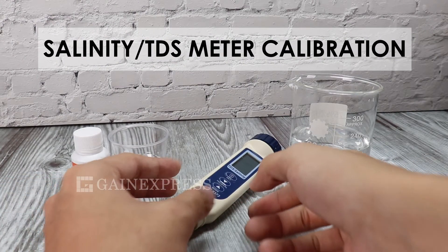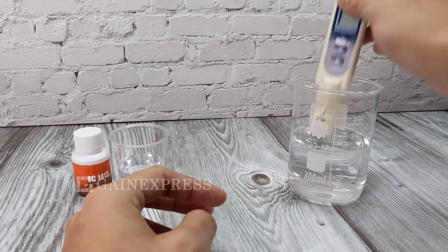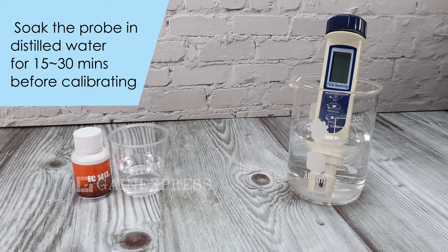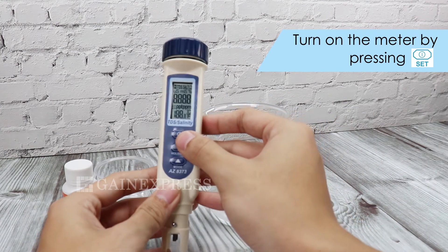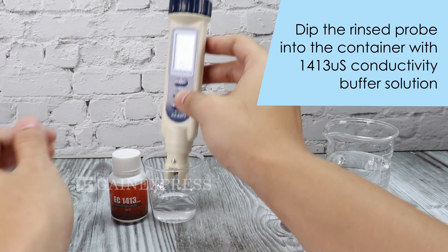Salinity TDS Meter Calibration. Soak the probe in distilled water for 15 to 30 minutes before calibrating. Then dip the rinsed probe into the container with conductivity buffer solution.